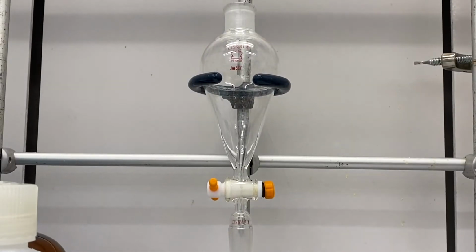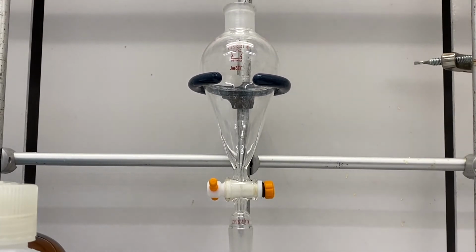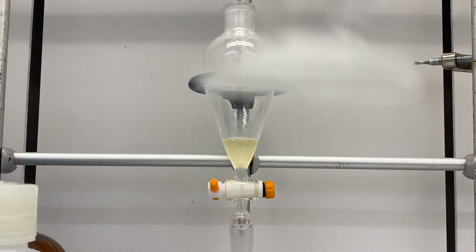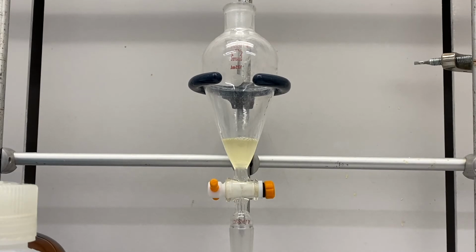Alright, so here's the separatory funnel. I'm going to pour my solution from my round bottom flask in there. So what I want to do first is wash it with water. The point of this is we're going to try to wash some of the acid out of the organic material before we add our sodium bicarbonate. We've got 25 mLs of water here. I'm going to rinse my round bottom flask with that real quick and pour that in.